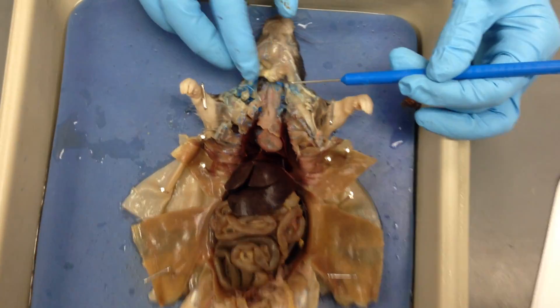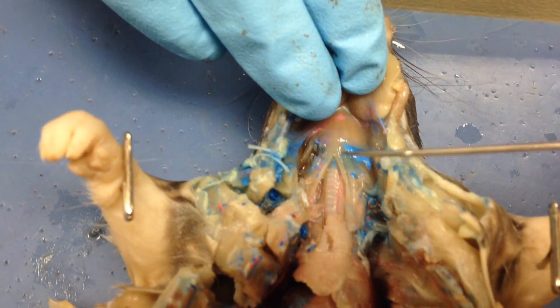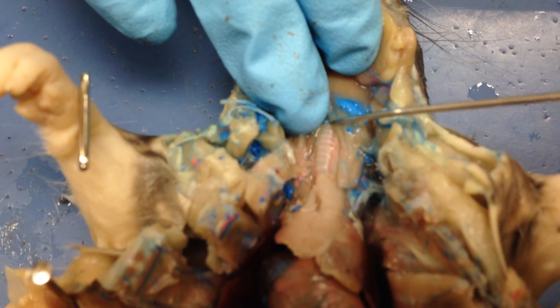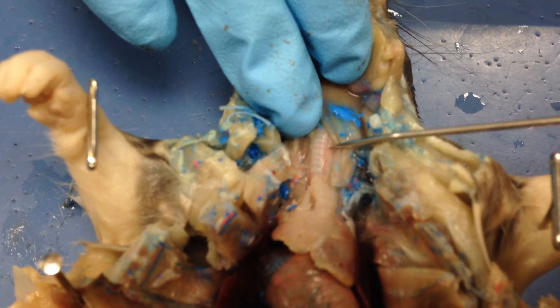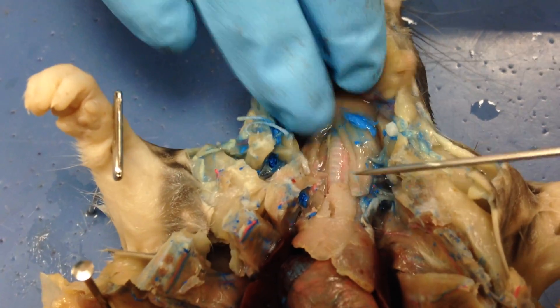So we have our rat up here. We have our salivary glands under here. We have our trachea — you can tell it's the trachea because of all the cartilage rings. The cartilage rings are the things that help keep the trachea intact, so without them the trachea would actually collapse. That's why you have the cartilage rings.